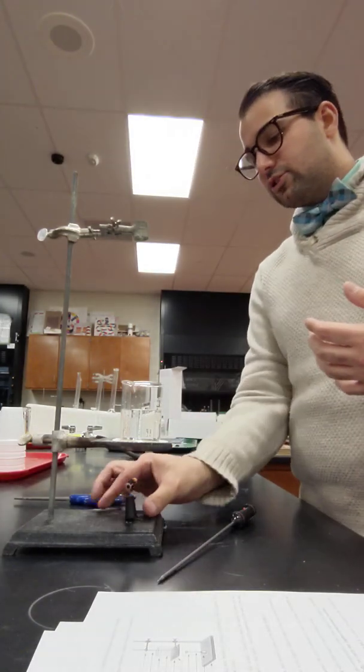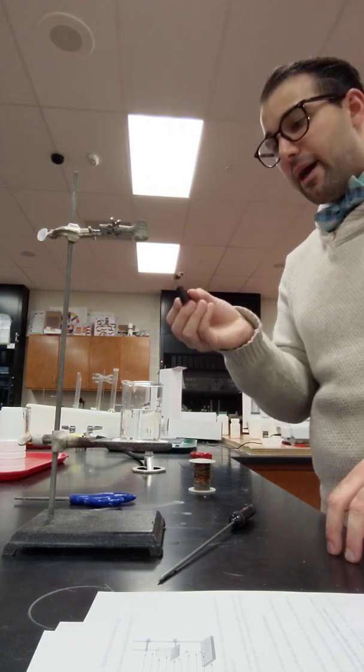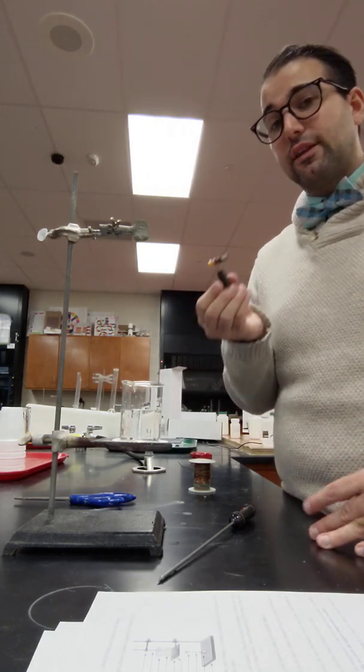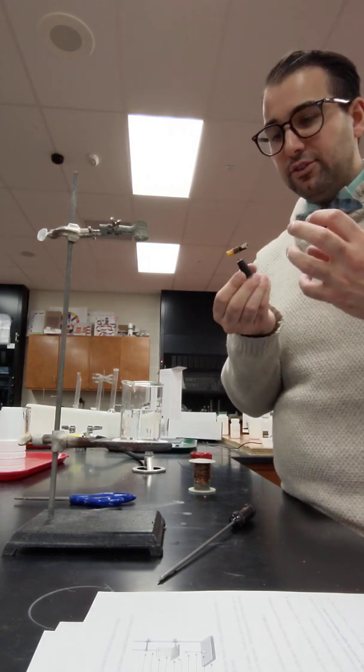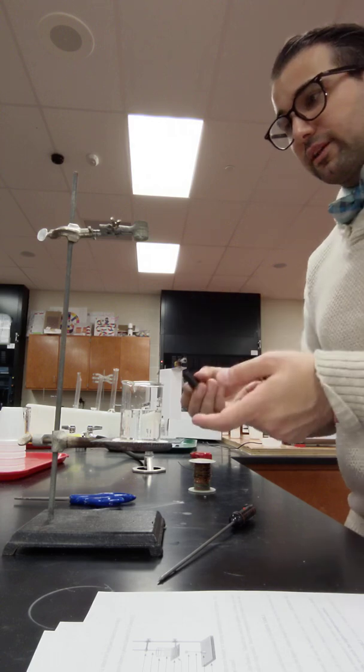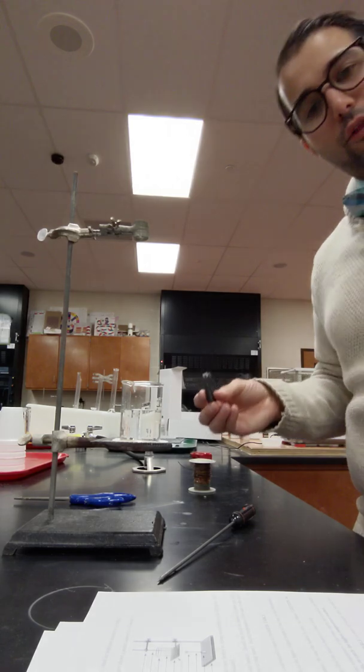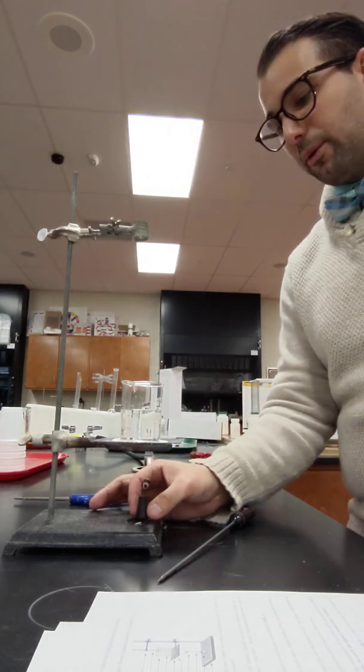In the procedure you're gonna get the mass of the Cheeto before you burn it and then the mass after on the balance and you're gonna write that in your data table. You're gonna see how much of the Cheeto burned and you're also gonna figure out how much energy that required because it transferred that energy to change the temperature of the water and you're gonna follow the post lab calculations to do those steps.